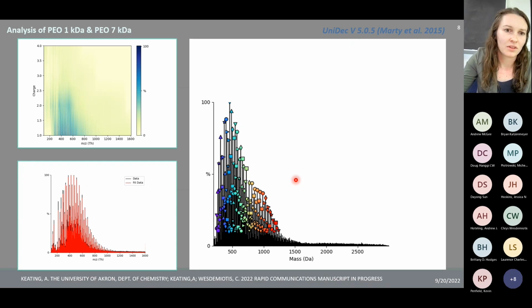Okay, so then your inputs are the range of charge states that you expect, from 1 to whatever you want as a maximum, plus a minimum level of confidence for the peak to be considered the correct charge state. Yep, exactly. There's a bunch of different settings that you can go through. You tell it the expected charge, and I usually overestimate.